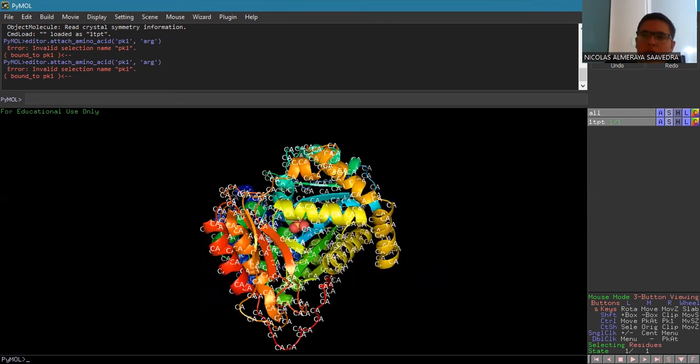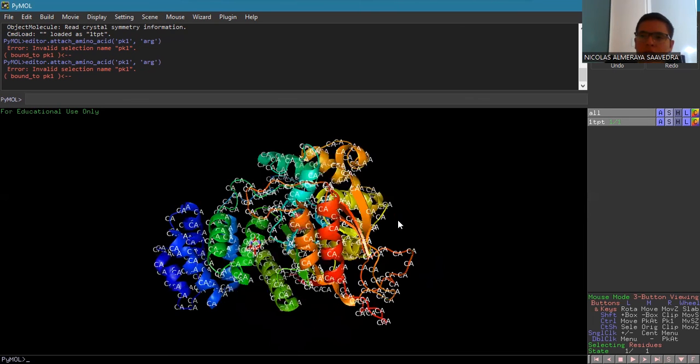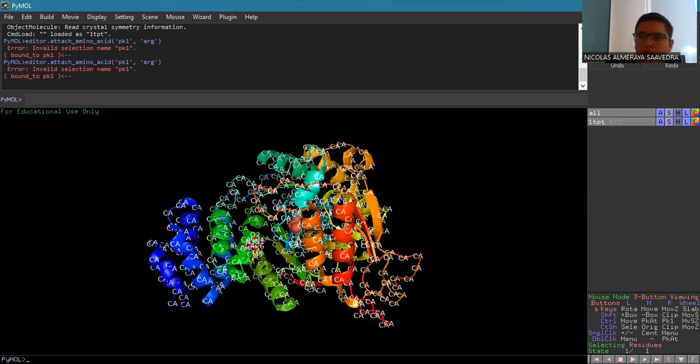The protein we are working on is thymidine phosphorylase, which is an enzyme involved in the metabolism of nucleotides and of great interest in angiogenesis, and is correlated with the aggressive development of tumor processes.